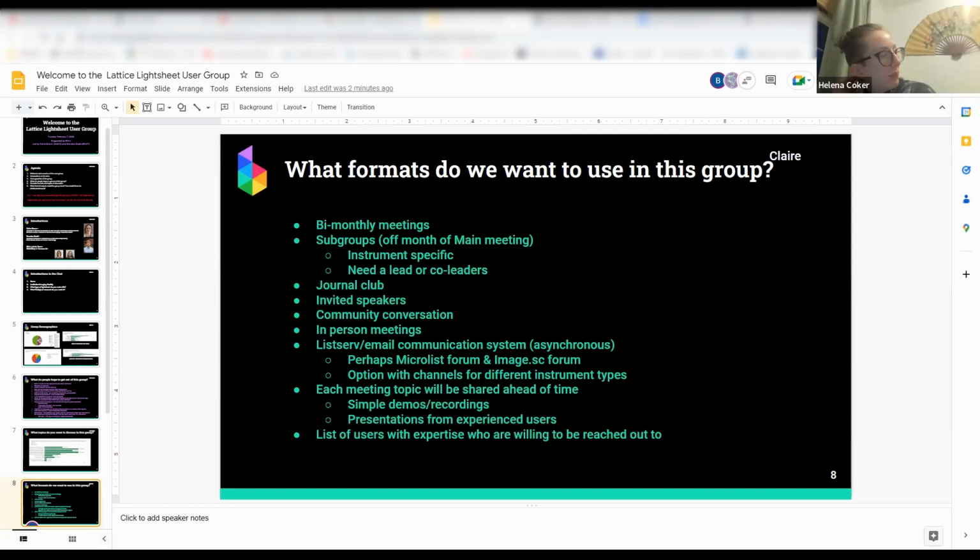Having worked with both, I think the upright versus inverted design, or the dipping versus the inverted design, does make a big difference. And then the flexibility, or rather the requirement to align, is very different on the 3i system to the Zeiss system, for example. It's not that some things wouldn't be of interest to other people, but talking about how you do a calibration or a setup on one instrument is very different to the other instrument. Sure.